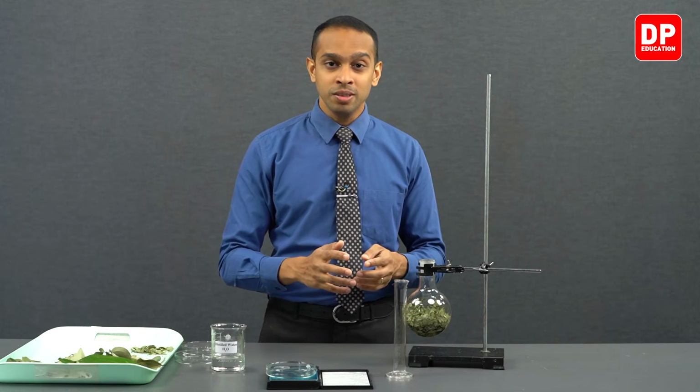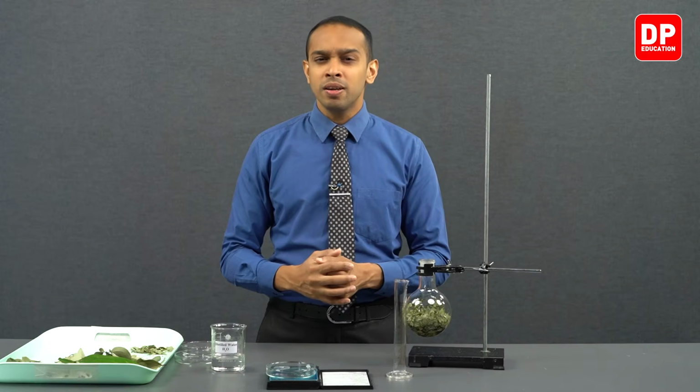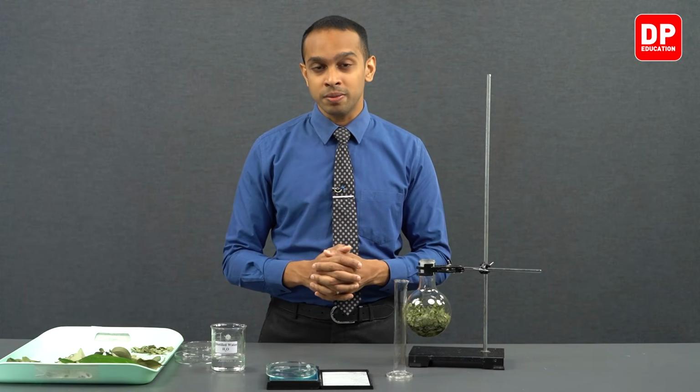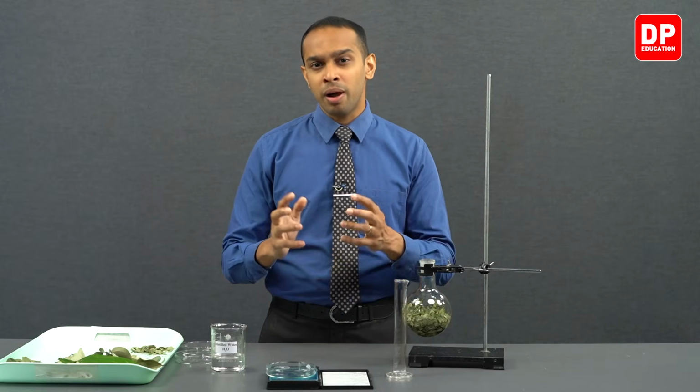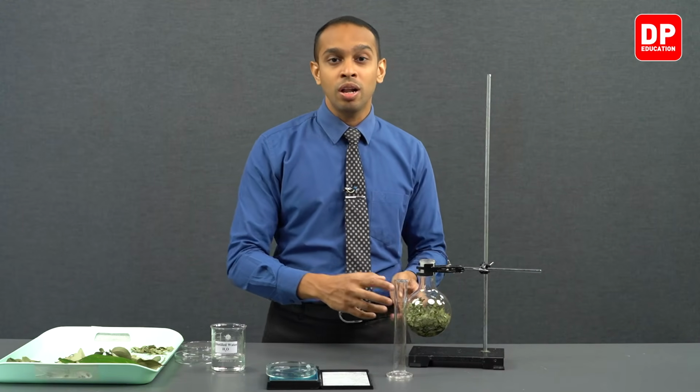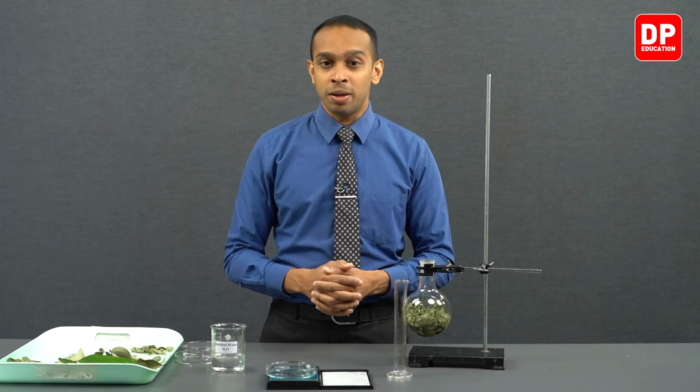So therefore, the mixture will boil below 100 degrees Celsius, which is the boiling point of water. Therefore, we can get the essential oil to turn into a gas way below its boiling temperature, or we can say in milder conditions, we can get our essential oil to turn into a vapor. That is why we carry out this essential oil extraction process.